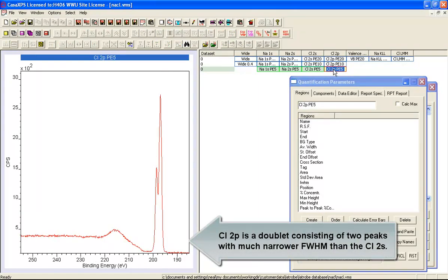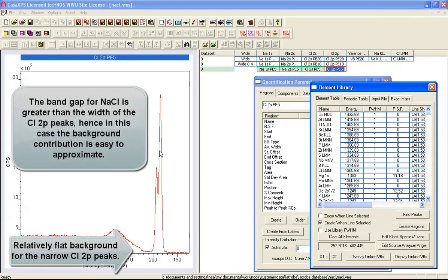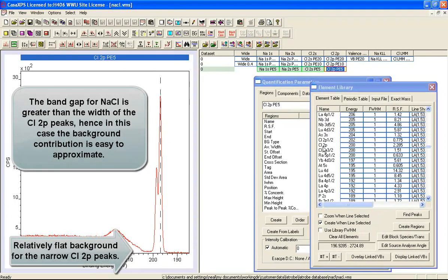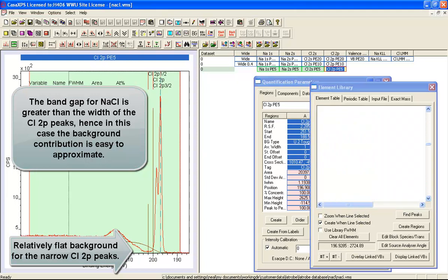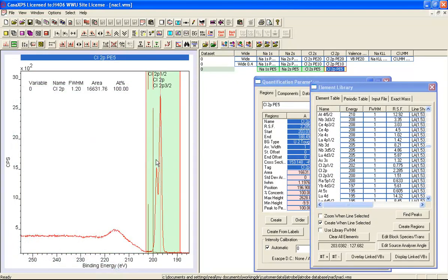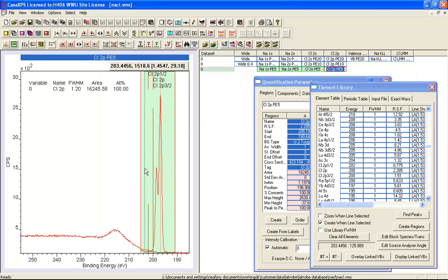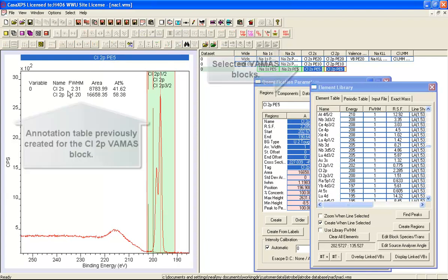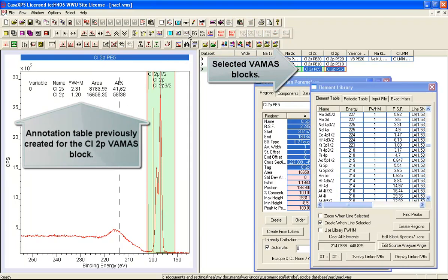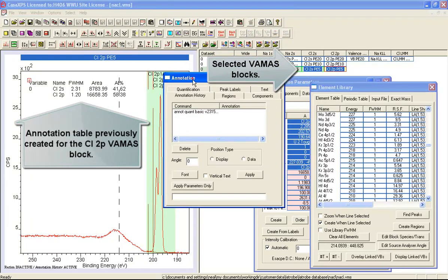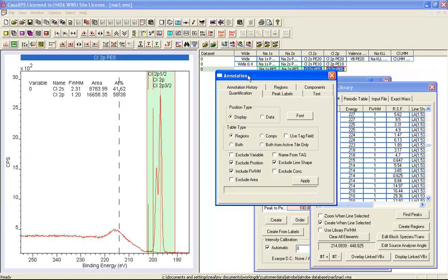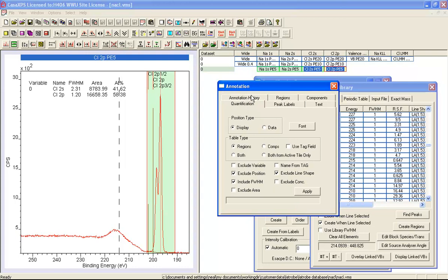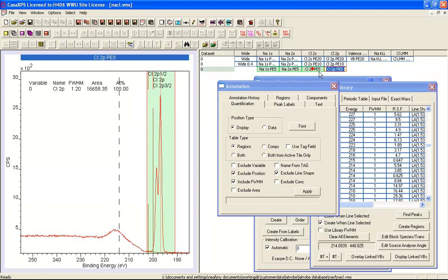What we'll do next is display the chlorine 2P and create a region in a similar way. What we have here is a quantification table that has been created using the quantification option on the annotation dialog window. This uses region information from the selected VAMAS blocks and displays it here over the data. If I deselect one of these you can see that the table changes. If I select it again holding the ctrl key down I now see the quantification between the 2S and the 2P.